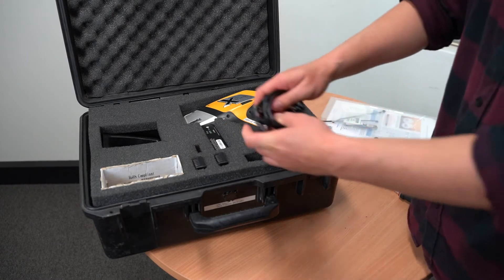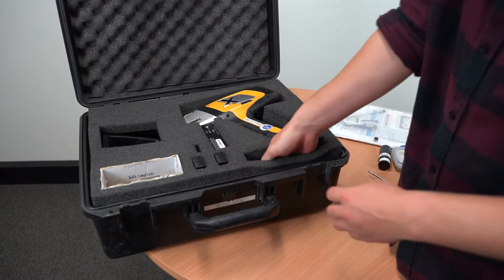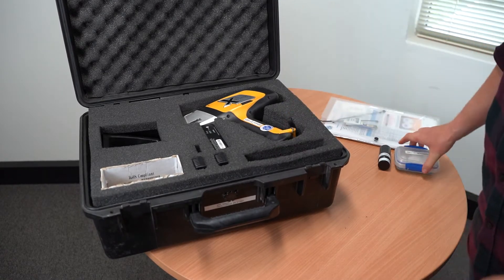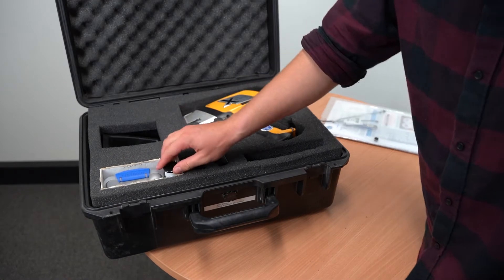Next, place the screwdriver and other cords into the slim pocket. Place the brushed CRM container in the other pocket.